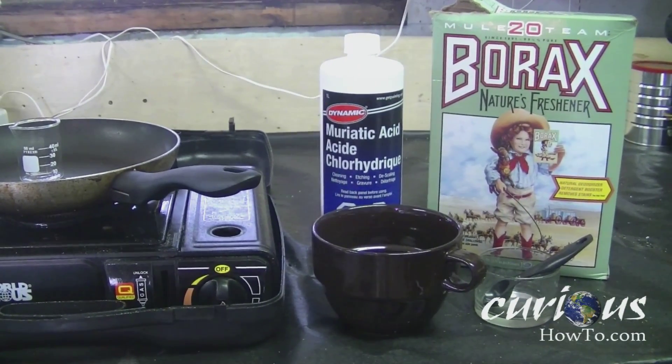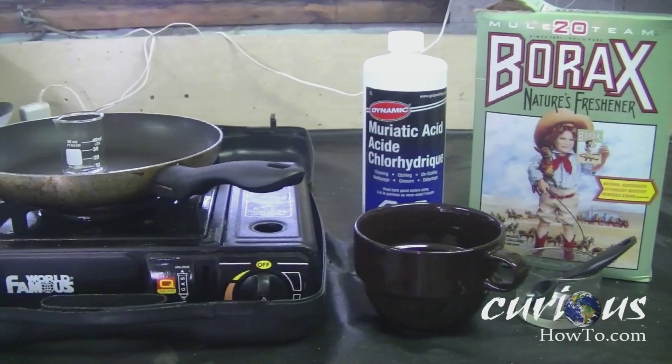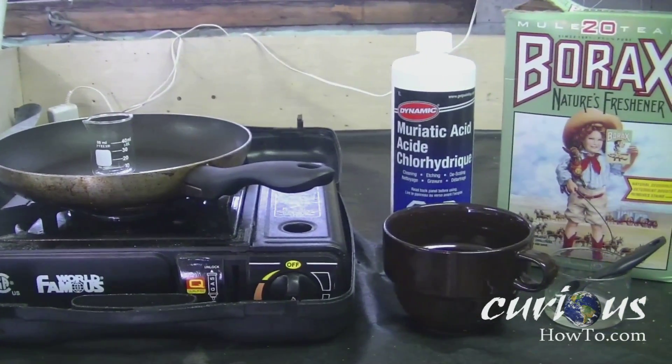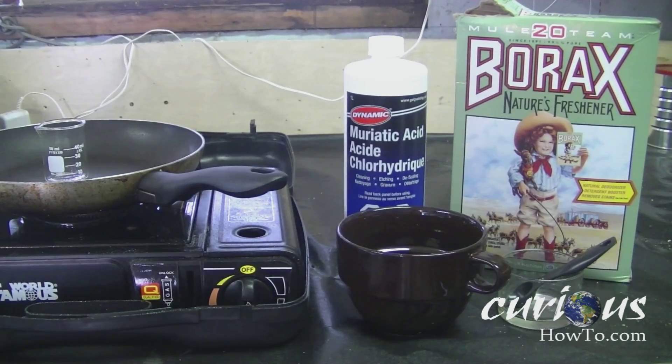To make the boric acid we're only going to need a few things. We're going to need some muriatic acid, which can be bought from a hardware store. We're going to need some borax, we're going to need a glass beaker, and also a container with some ice in it so that we can cool the solution once we're done.